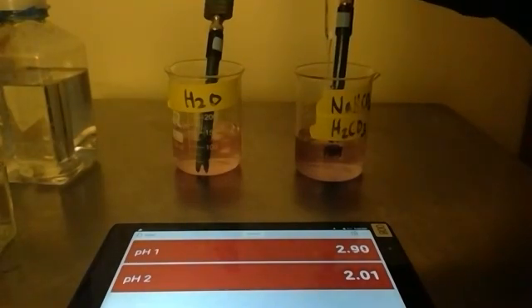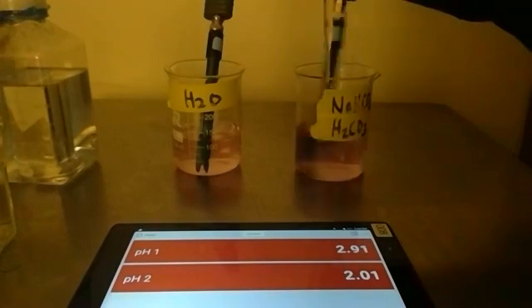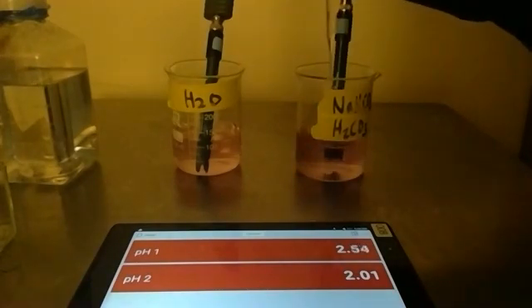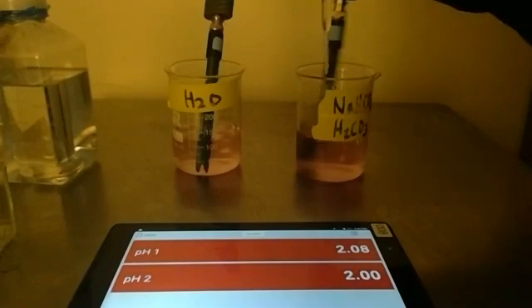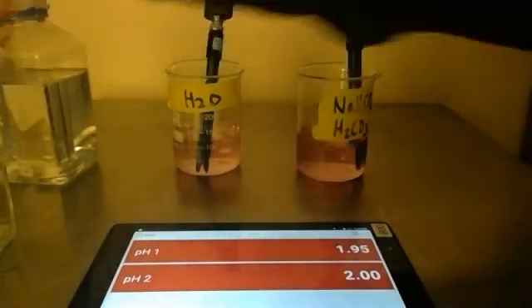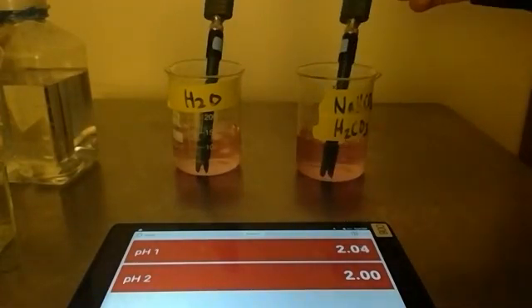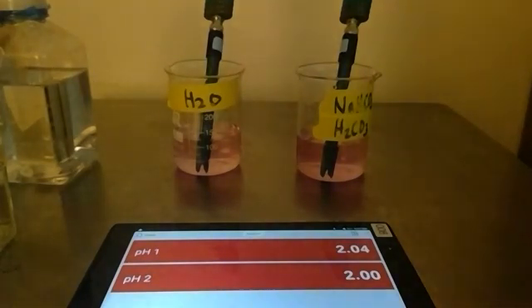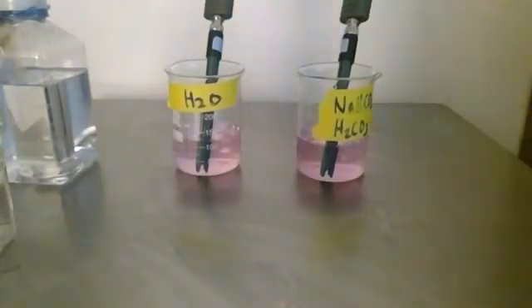Here's 13 and 14. 15, 16. 17, 18. And 18 drops brings us down to about a pH of 2, just like the water. We saw a large change occur with our buffer capacity when it was reached. That means we just expended all of that buffer. There was no longer any weak base for our strong acid to react with, and so the solution really stopped neutralizing the acid that was added. And we saw dramatic pH change.